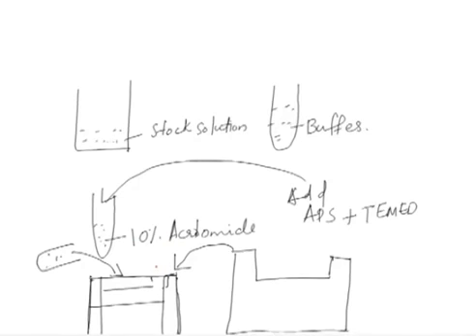Once you have done this, remove any air bubbles. You can put a layer of organic solvent on top of it, just to make a uniform shape here rather than disturbing bed above bed, and finally it will solidify very fast, in say 15, 20 or 30 minutes. Once it is cast, it will be put into the running apparatus, which contains electrodes, a place for electrode buffers and so on.